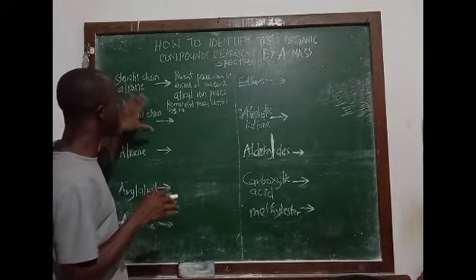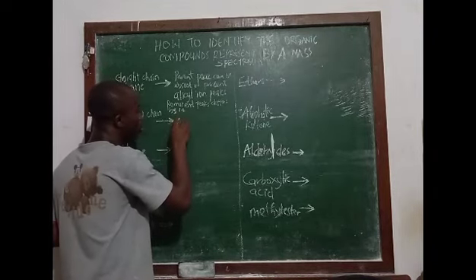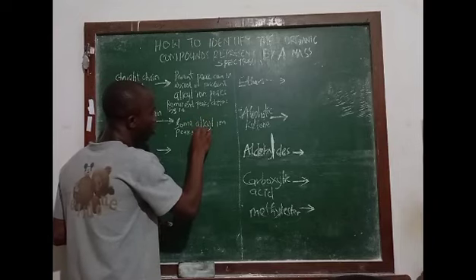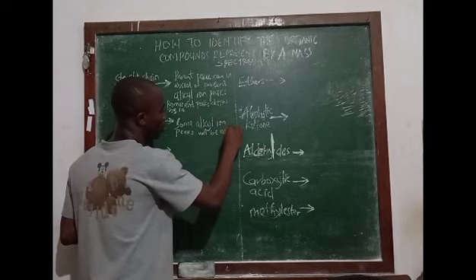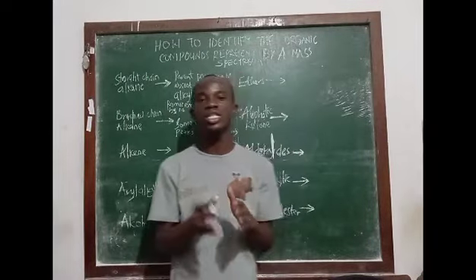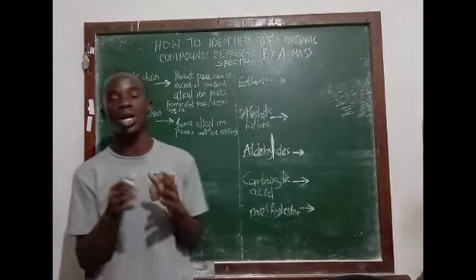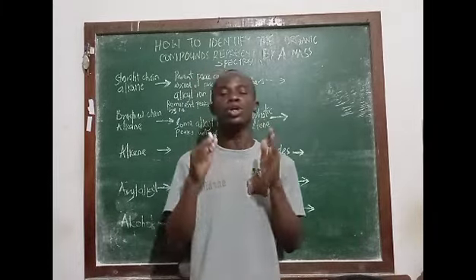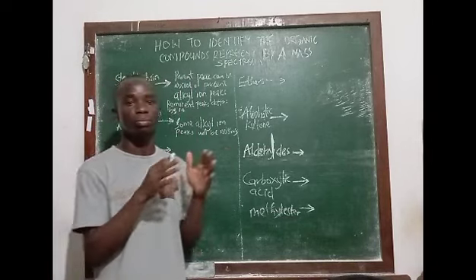So in a mass spectrum that represents a branching alkane, you can say that some alkyl ion peaks will be missing. Unlike what you have in a straight chain alkane, where you expect to see all alkyl ions, depending on the length of that particular alkane, in a branch chain alkane, you will not see all the alkyl ion peaks. Some of them will be missing.